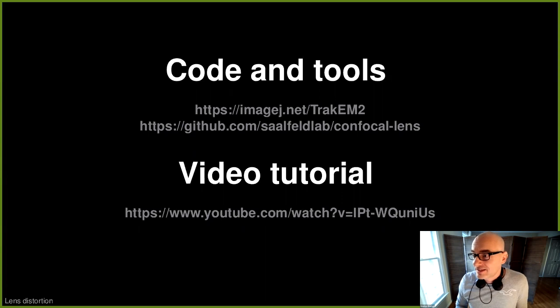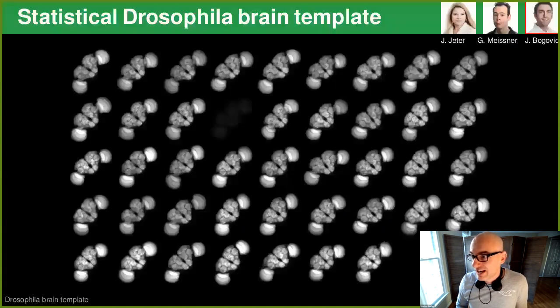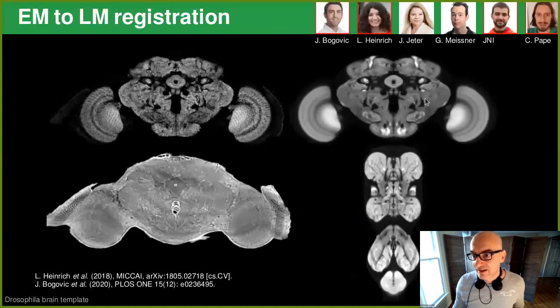So this was extremely useful and instrumental to create a better atlas for the Drosophila brain, because now we could stitch brains without overlap artifacts. And this is what John did together with FlyLight. These fabulous guys imaged 60-something brains for us. John created a symmetric atlas for the fly brain, central brain, and the VNC.